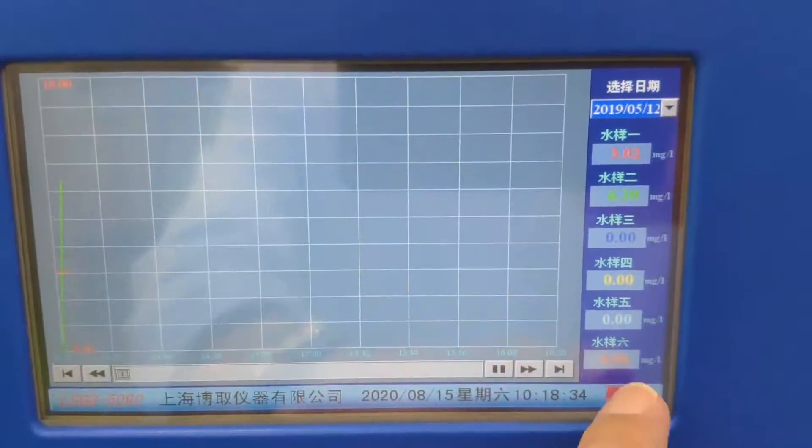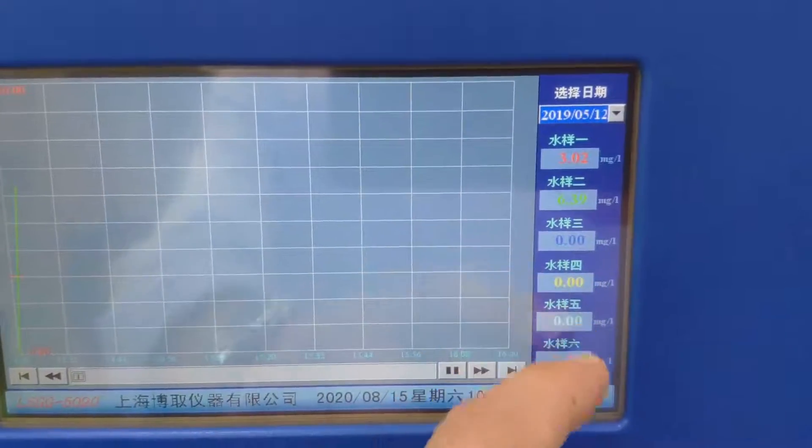Here is the history data. One, two, three, four, five, six — these are the channels.